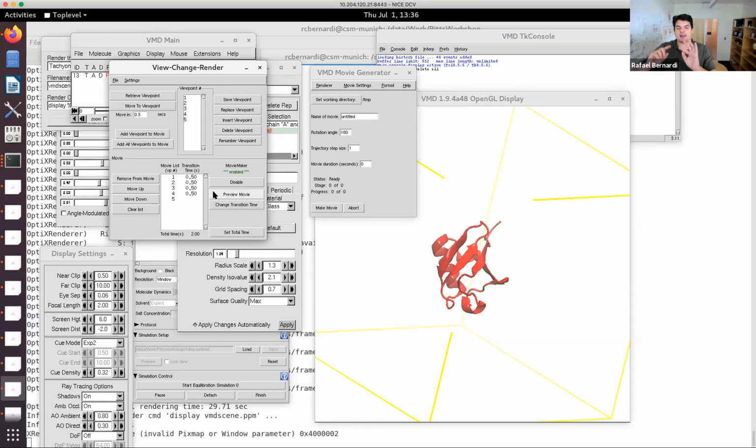That's a good idea. The other thing is, for instance, the video that I was showing where I changed the focal point, I did everything with VMD. But if you have one JPEG with one focal point and another JPEG with another, there are tools in these programs that take you from one to another. They just create a merge between the two. And then you create a whole trajectory of going out of focus to the next one, and you don't need to render again, which is faster. So there are many tricks like that if you start using this other software.